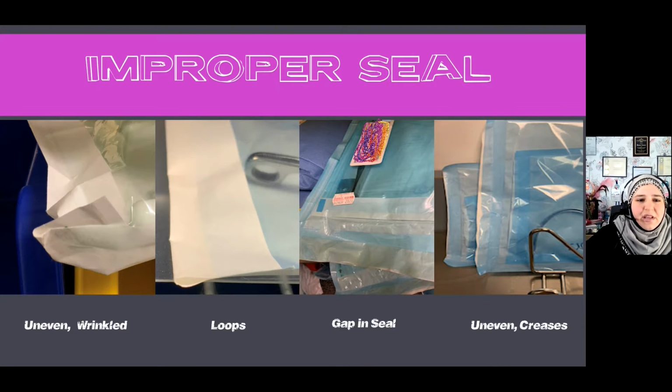And then we got loops, right? It's not that great to see, but you can see there's a loop at the bottom. That means that your pouch is still open. It's really not completely sealed. And so is it really acting as a barrier for microorganisms? We have gaps in the seal. You can see more towards the left here, there's a big square gap in the whole seal. It didn't actually seal correctly.